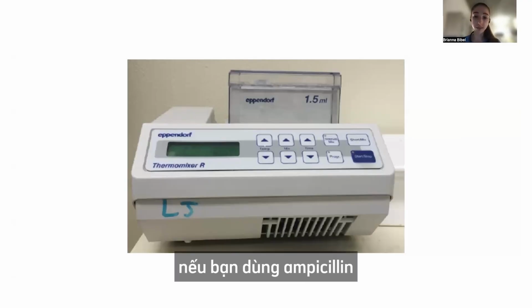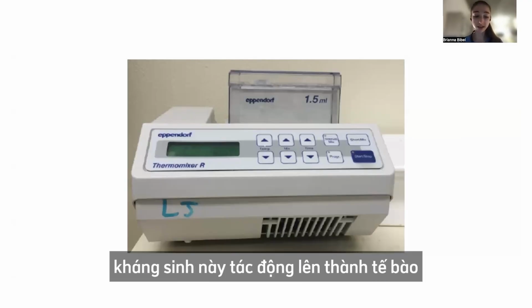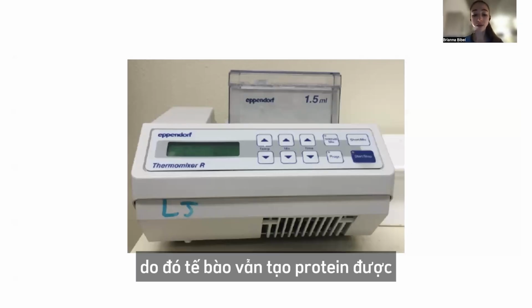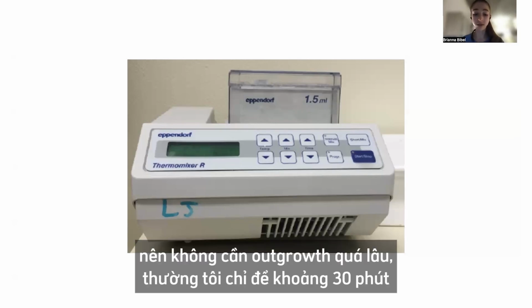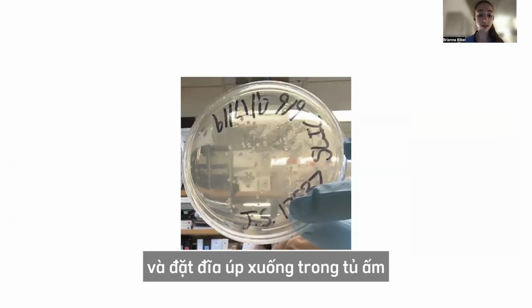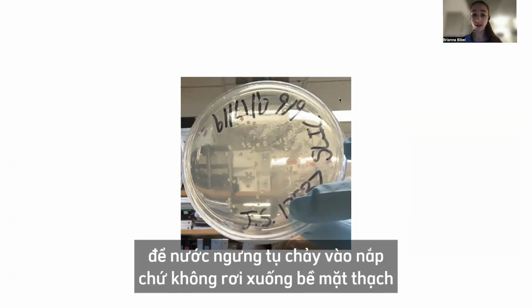Alternatively, if you're using something like ampicillin, here you're targeting the cell wall, not the protein making, so it'll still be able to make those proteins. And so you don't need to give it as long an outgrowth. So typically I'll give it like half an hour. At that point, you can then go plate your cells, stick it in the static incubator with the plate upside down so that any condensation is falling on the lid and not onto your plate.